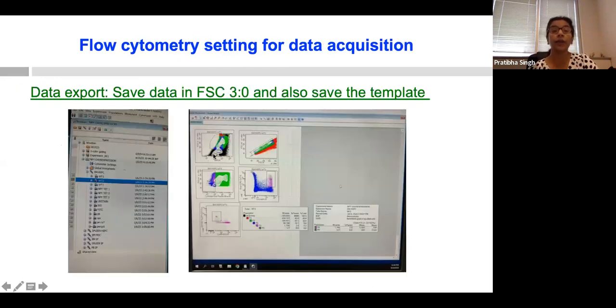Like here, these were sample mouse bone marrow samples, and we used a mortar and pestle to take the bone marrow cells out of the bones. When we crack the bones, the bone particles also come out, and there is other debris that can come into your sample.